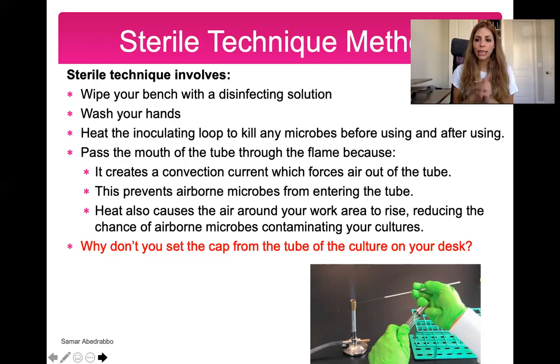Then you wash your hands. You want to make sure that when you're running any experiment, you're washing your hands really well, because our hands have a lot of bacteria, a lot of microbes on them, and we don't want to ruin the experiment we're running. Now, another important point is that this is a microbiology class, so you transfer bacteria. I know this is an online class right now, but in the lab, you're transferring bacteria a lot.